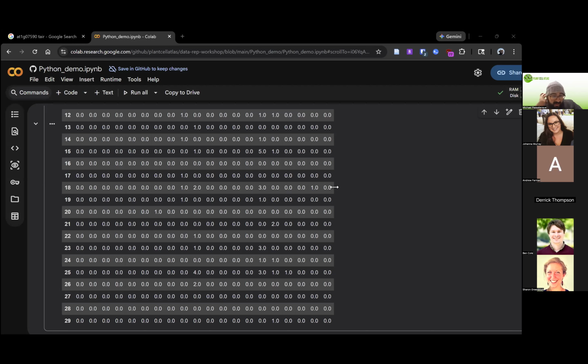We're going to do single nuclei RNA-seq from different conditions. So I have multiple biological replicates per condition. How do I integrate these samples in ScanPy? I would integrate biological replicates per condition first, just across biological replicates, and see if the data looks reasonably integrated without any further integration. And if not, I would then try integrating all of the data sets at once across replicates to see if that is better.